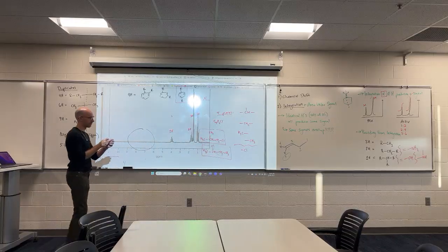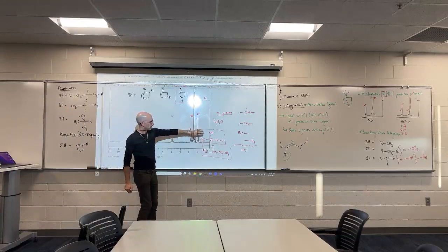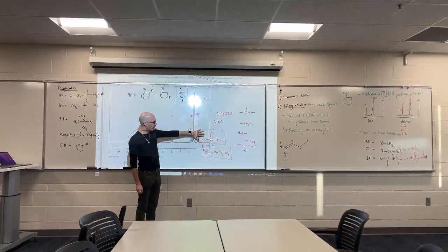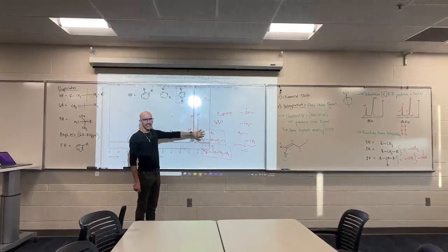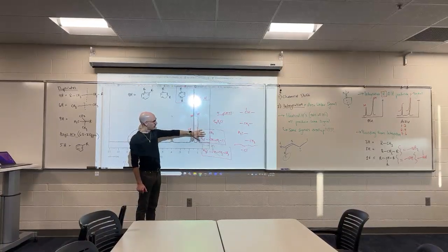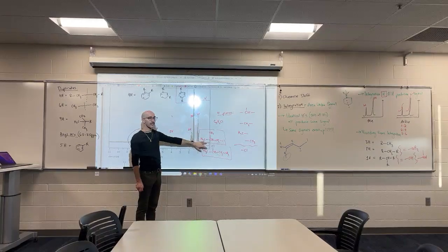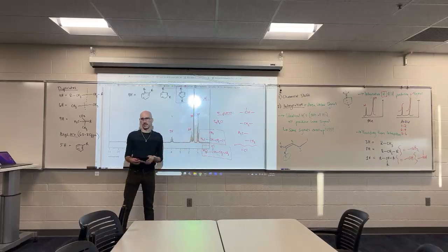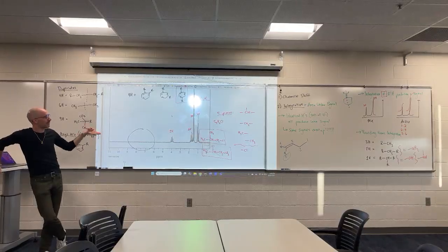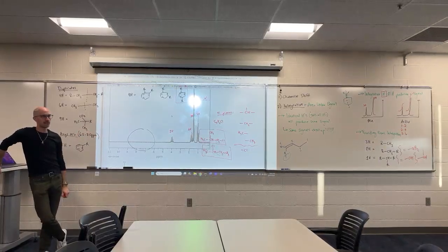And that's another option. This is 2-methyl-1-chloropropane, also called isobutyl chloride. Well, I said that wrong. 1-chloro-2-methylpropane. And this is 2-chlorobutane. Those are structural isomers of each other. And I think those are the only 2 structural isomers you could get based on these integration values.